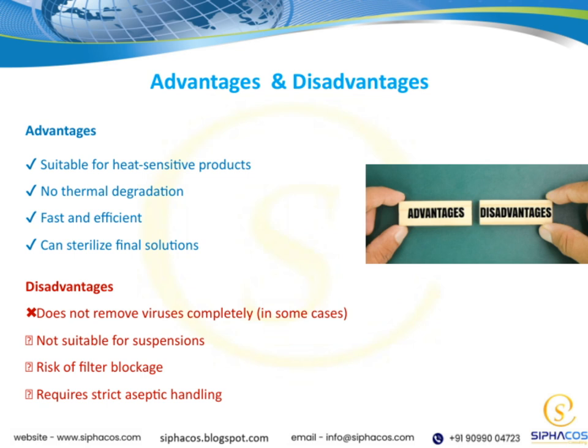Now, on the flip side, there are some disadvantages we should keep in mind. For example, it doesn't always completely remove viruses, especially in certain cases, which could be a concern depending on the application. It's not suitable for suspensions, so if you're working with particulate matter suspended in liquids, this method might not be the best choice.